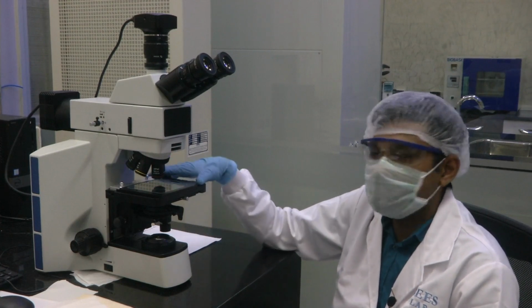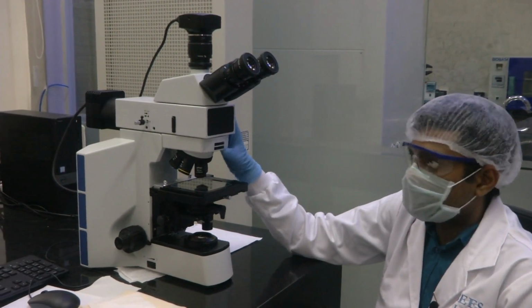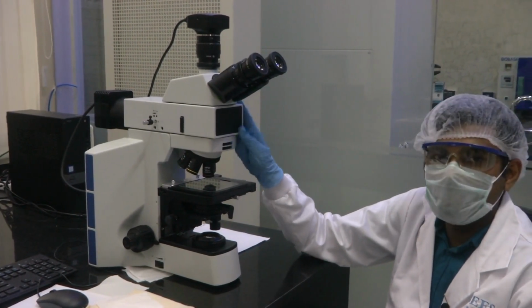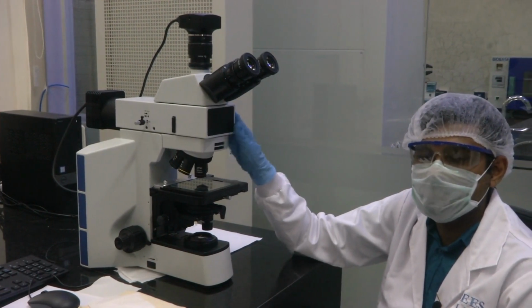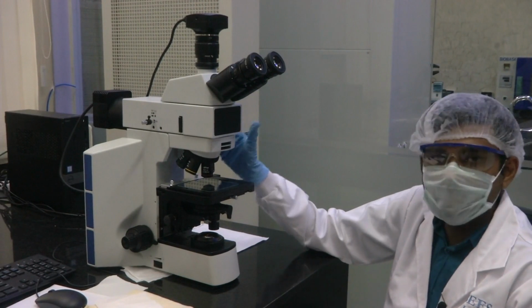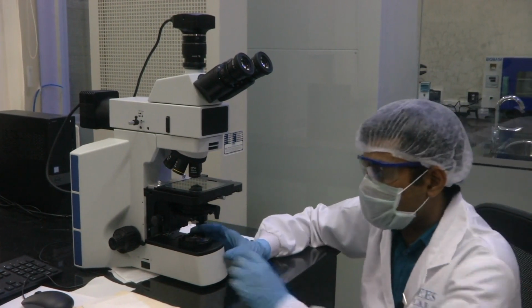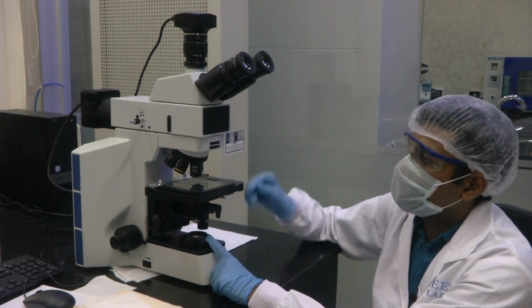So, we have the metallurgical microscope here. As you can see at first instance itself, this is a much more complex microscopic arrangement as compared to the stereo microscope that we had seen last time. Before I go into the details of the different knobs and features available on the microscope, let me introduce the basics first. This microscope has both bottom illumination and top illumination.